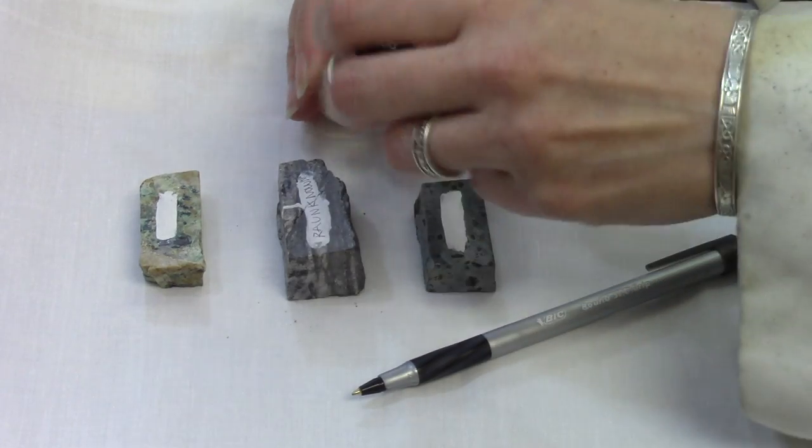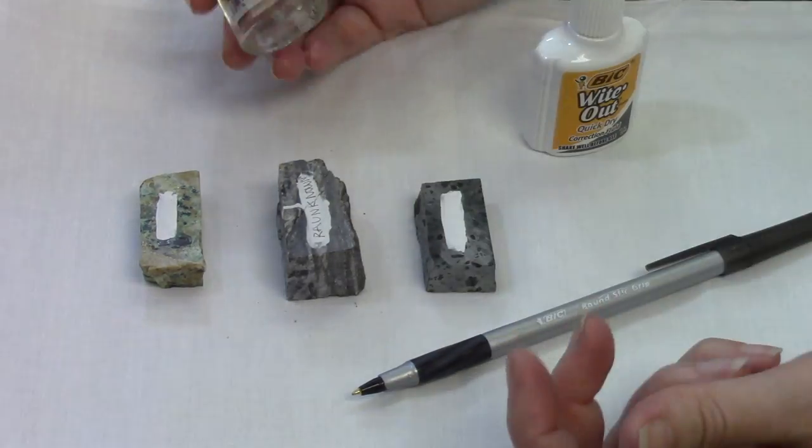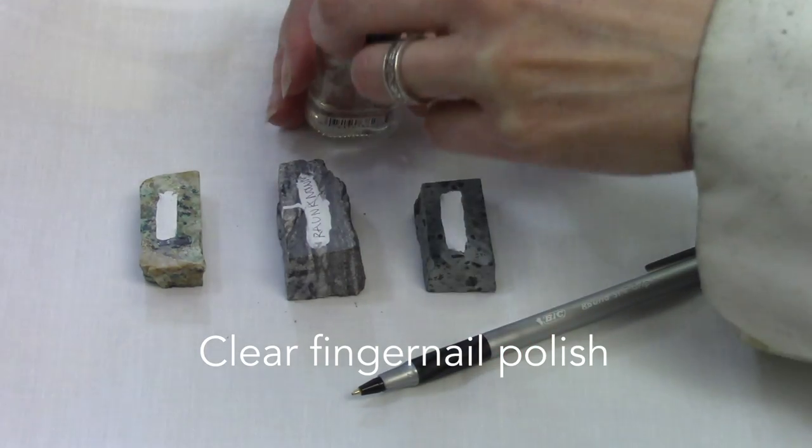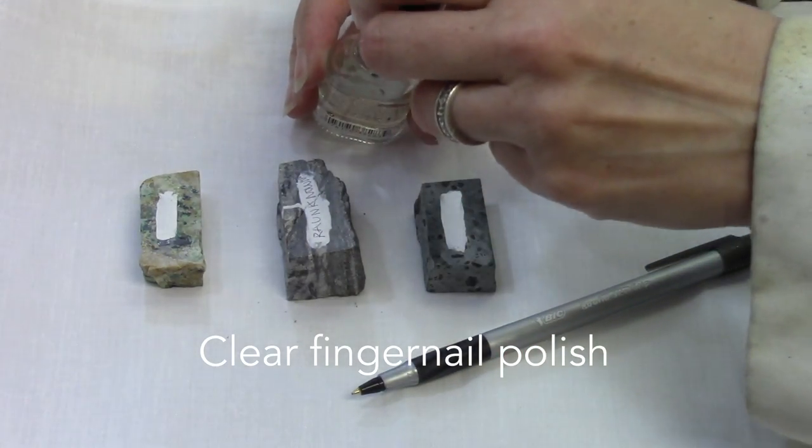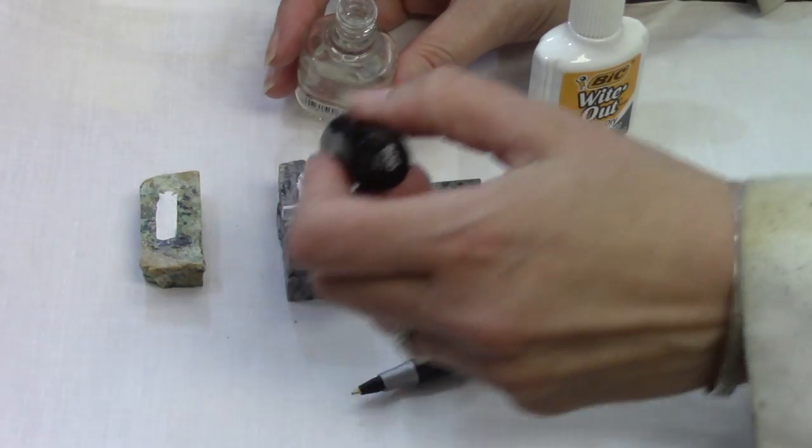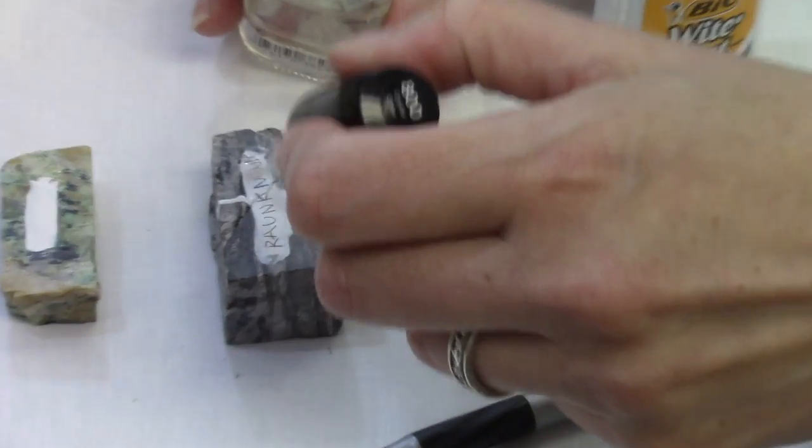This additional step requires you to take clear fingernail polish or another finish and put a layer on top of your label.